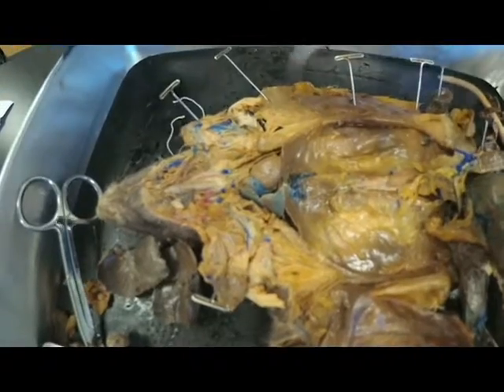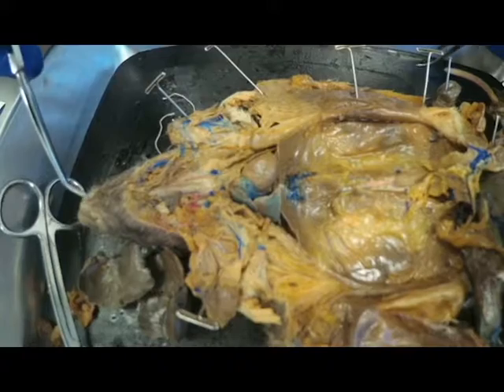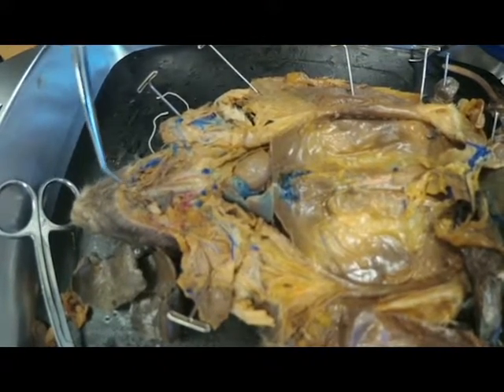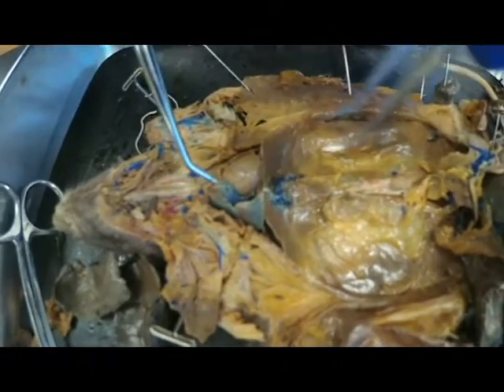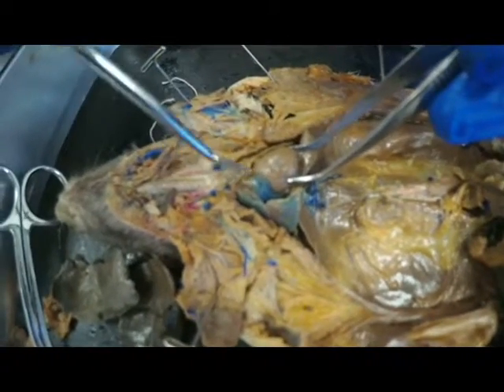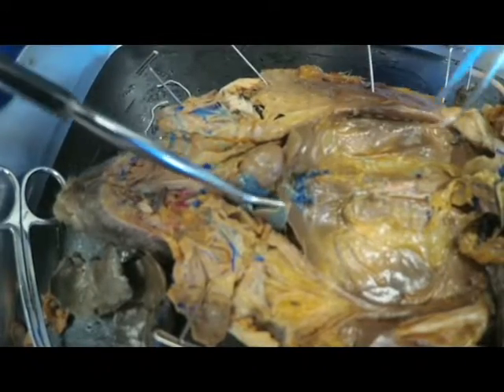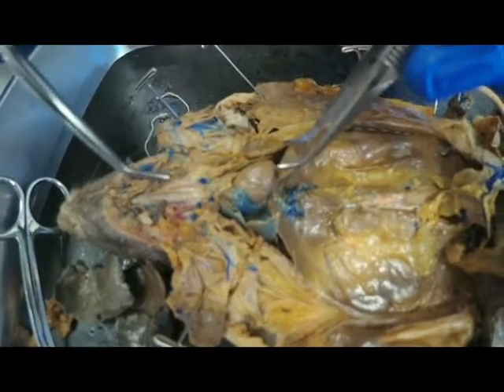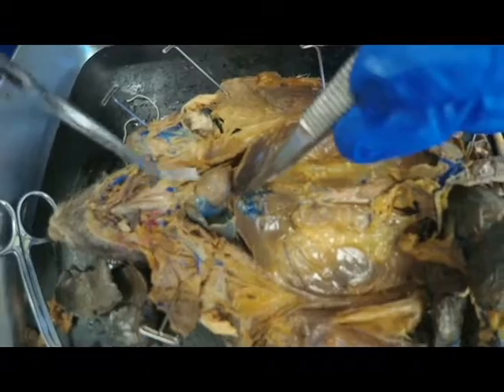Okay, so here we have our thoracic cavity. We're going to start up here with the mouth, the nose, where the rat is going to breathe. The air is going to travel down the trachea and into the bronchi. You can't see the bronchi because they're small, but it's the beginning branching of the lungs. And then here we have our right side of the lungs, and then here we have our left portion of the lungs. The right part of the lungs is bigger because the heart has to fit into the left.